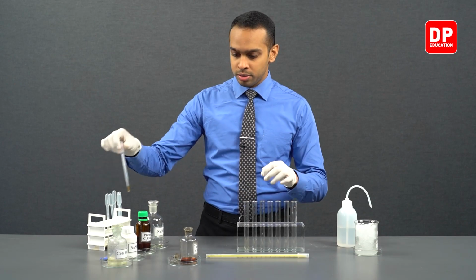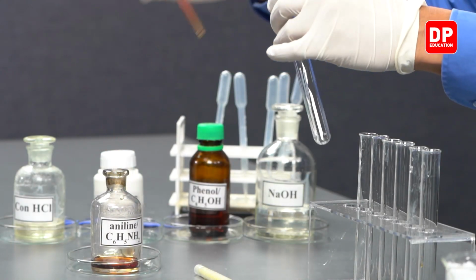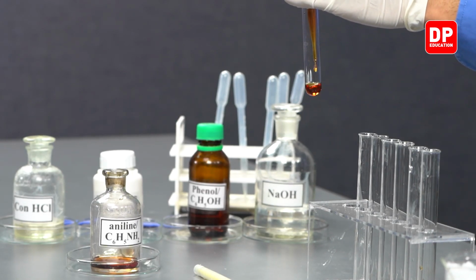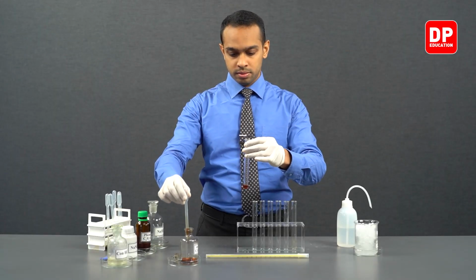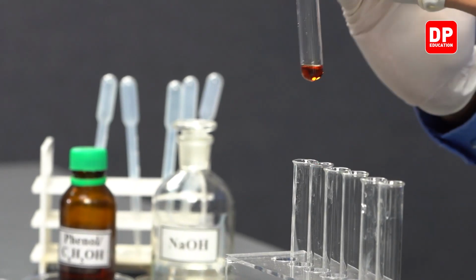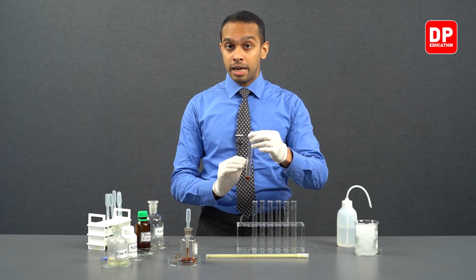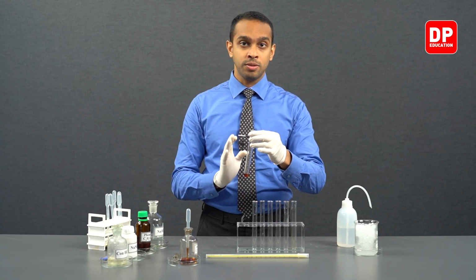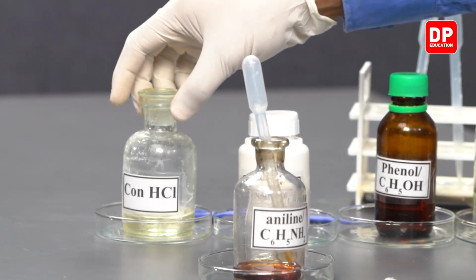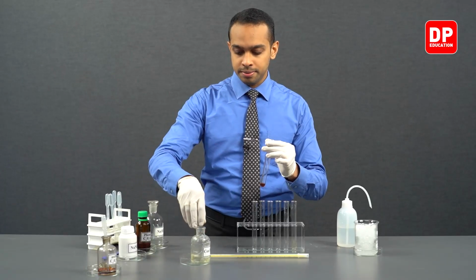we are going to take about 0.5 cubic centimeters of aniline. Now, we have taken about 0.5 cubic centimeters of aniline into a test tube. We can add 5 cubic centimeters of concentrated hydrochloric acid to this aniline. We have our concentrated hydrochloric acid here.